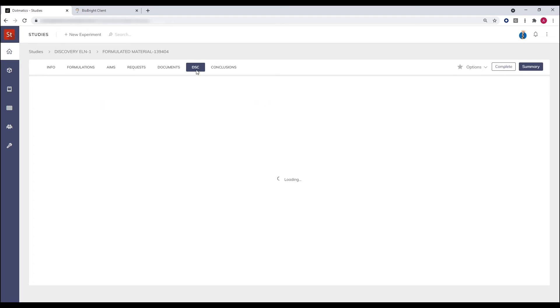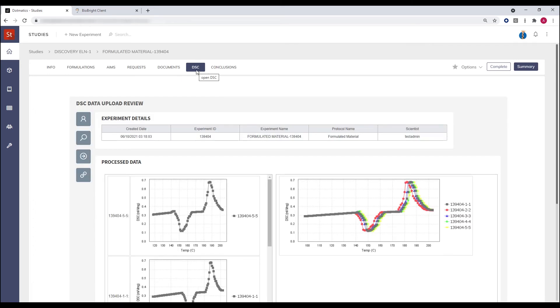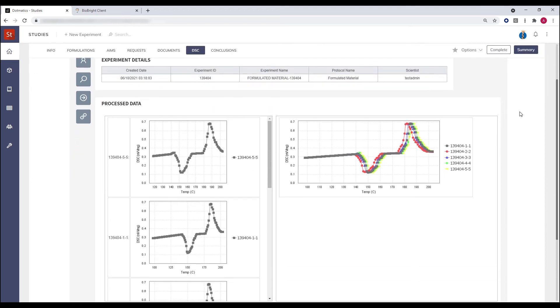On the DSC tab, we can see all of this information here. We've got some visualizations showing the DSC traces of the information from the file. Here on the right-hand side, we can see each of the samples that were tested and an overlay of the DSC curves of each.